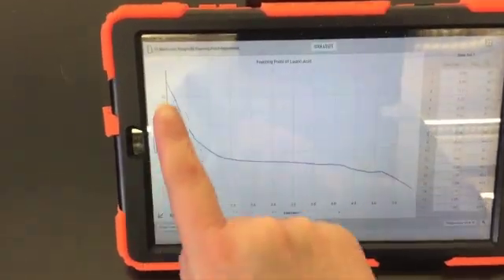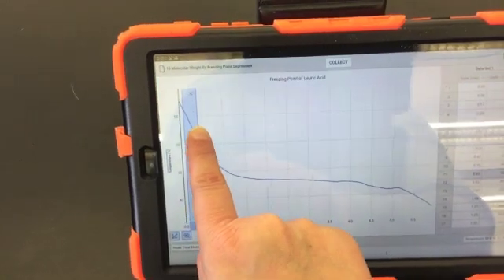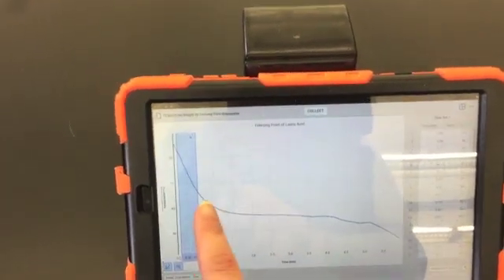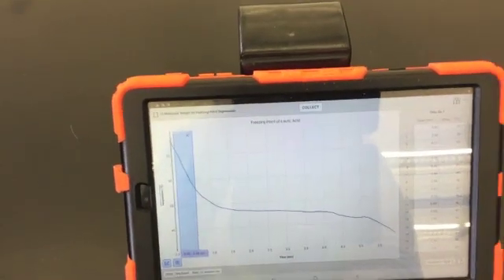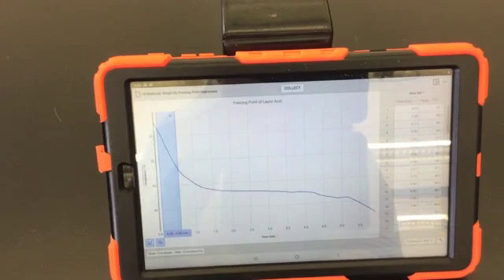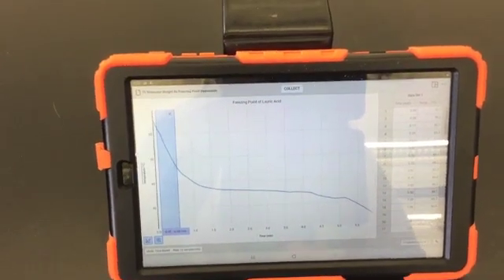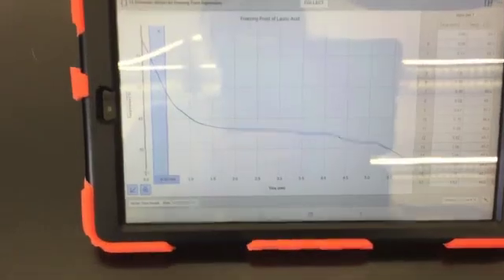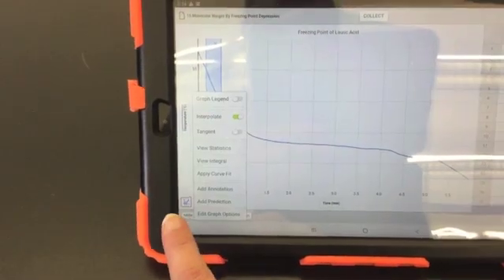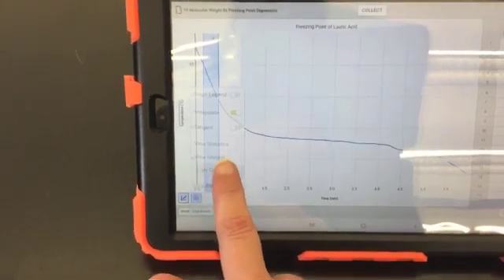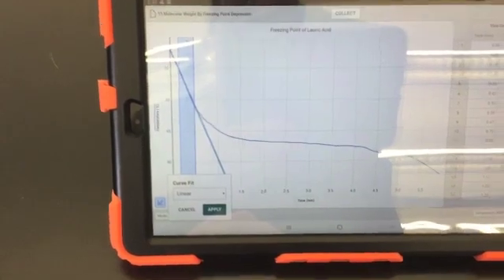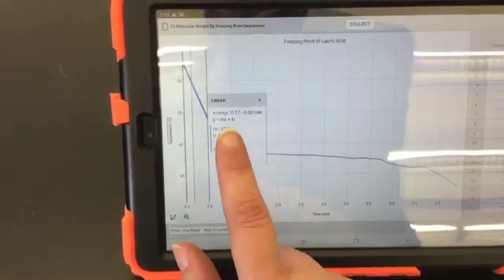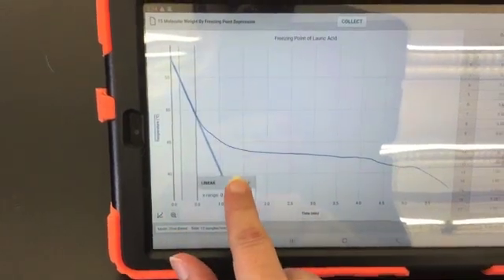We're going to highlight the portion of the graph that has a very straight slope. You do this by drawing your finger across the iPad — you can do the same thing with the mouse. You can see that near the top there are slight curves, so I might want to narrow this region just a little bit to make sure I am not getting areas that will affect the straight line pathway. Once I have highlighted this region, I now need to have the linear fit of this data. I'm going to click on the graphical icon and have it apply a curve fit — it will apply a linear fit by default. I'm going to hit apply, then click on the box and move it down so it's out of the way.